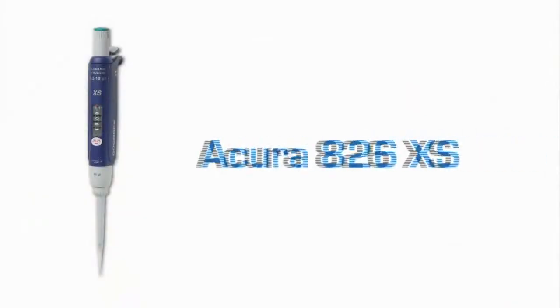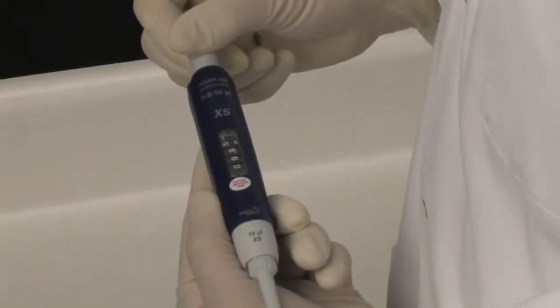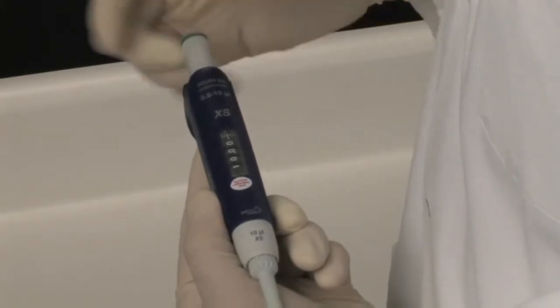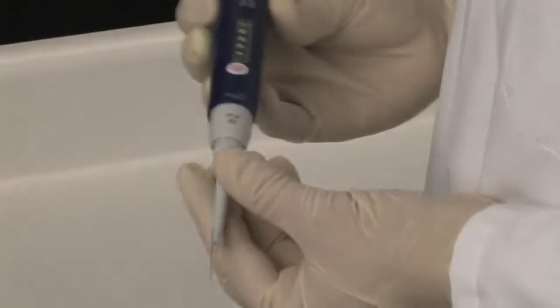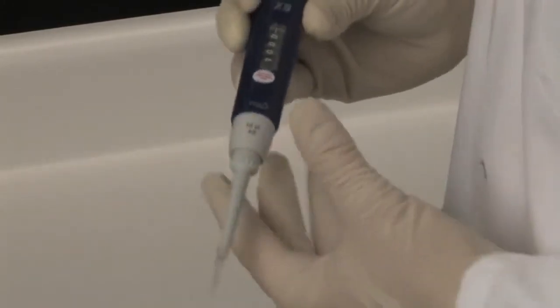The new Acura 826XS is specifically designed for research applications to make working with critical samples trouble-free and more precise. While providing all of the standard features of the Acura Manual line of pipettes, including precise setting and checking volumes, as well as user-friendly tip adjustment to accommodate a variety of tips.